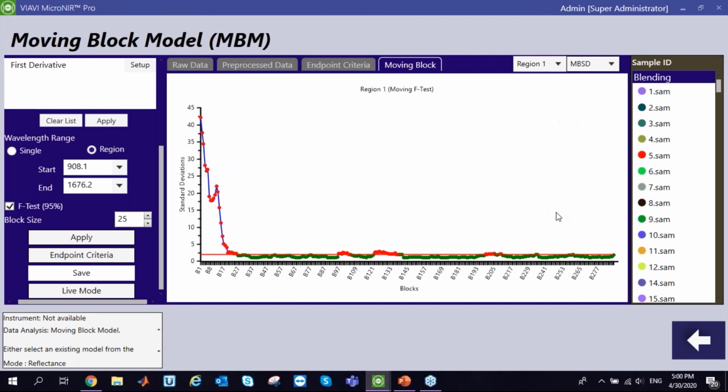And this is what we call consistency in chemometrics. This is something that, when you are doing blending, you have to try to find. And also overlapping different blendings made with the same mixture will help you in understanding your right endpoint.